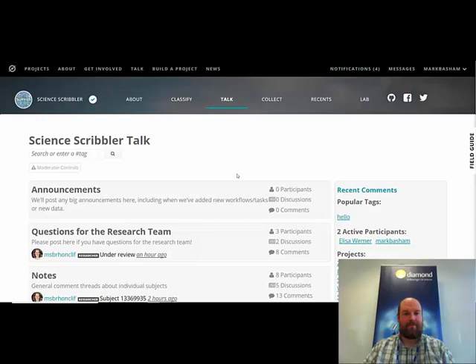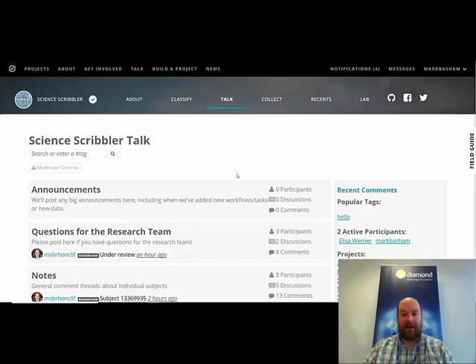I think that's pretty much everything that I need to talk to you about. Hopefully, this brief demo will give you a good idea of how to use Science Scribbler. And really do be aware that all of the information, so the information we're collecting here, we're using to train algorithms to be able to use this automatically to segment data and to get the best out of the data that we collect at Diamond in the future. So everything you do will be phenomenally useful to us. So thank you again for being interested in the Science Scribbler project and good luck with classifying all of the data for us. Thank you.